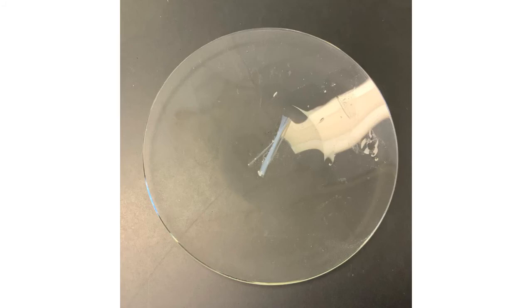If we were doing this experiment, you would have done this as a group, and this is what you would have seen. This right here is a chunk of psoas rabbit muscle. It's white. We'll learn about red versus white muscle a little later on. There is a difference between fast and slow fibers. You can see these are white fibers, so put that in the back of your mind for lecture.